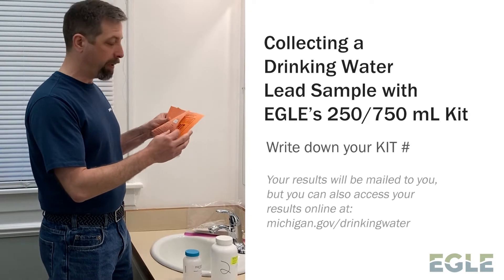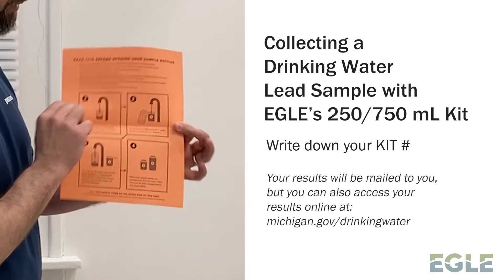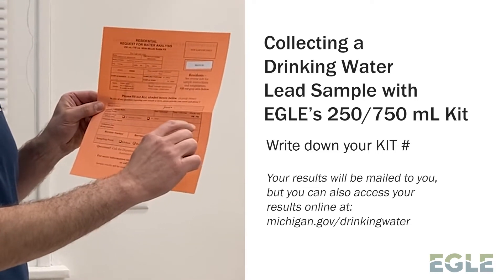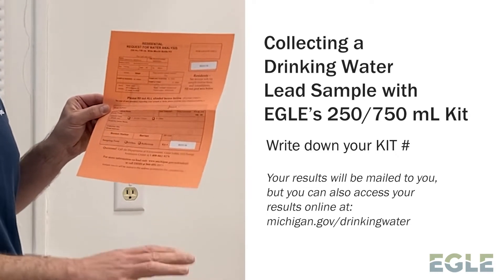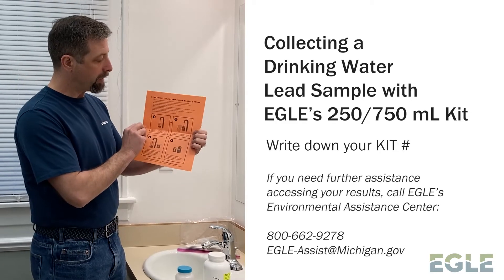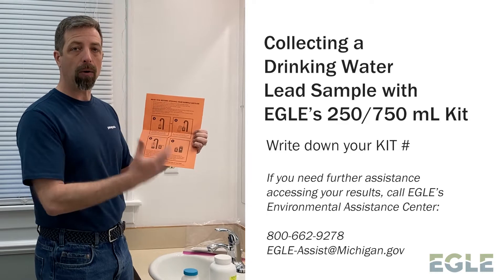This colored piece of paper has two different sides. The front side is all about getting your information down so that when you send this in, we know exactly who took the sample and where to send the results back to. The back side is all information about how to take the sample.